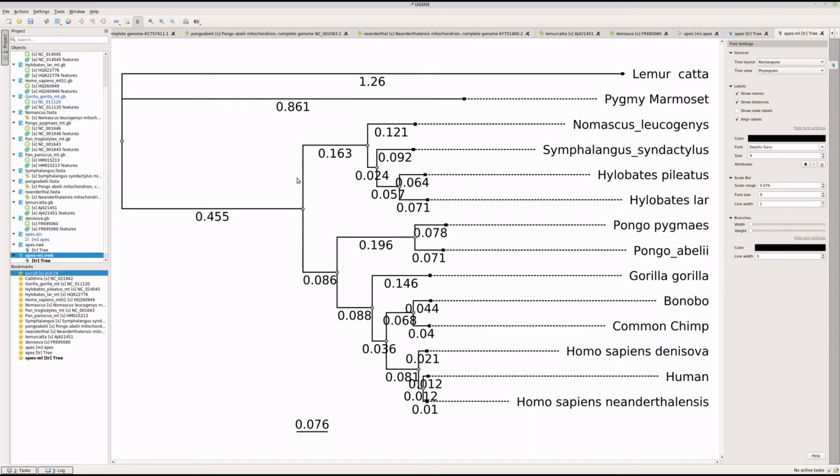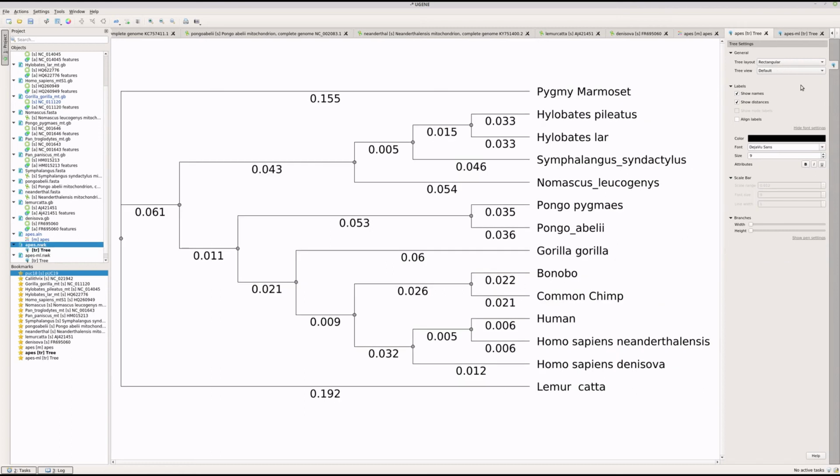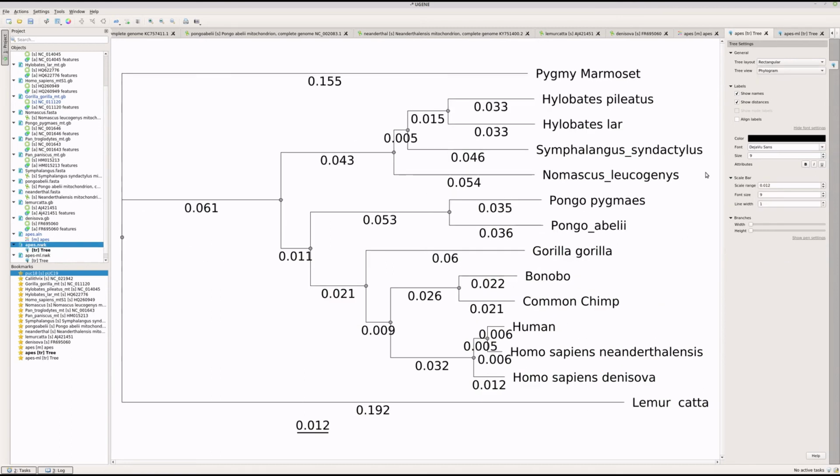So in any case, what is the utility of this? Well, like I said, neighbor joining is great if you just want to see something very quickly. You can do it this way as well, and also have something similar displayed to us, right? And the other thing that we have before us is that, remember, we save these files as Newick files. They're in our file system.